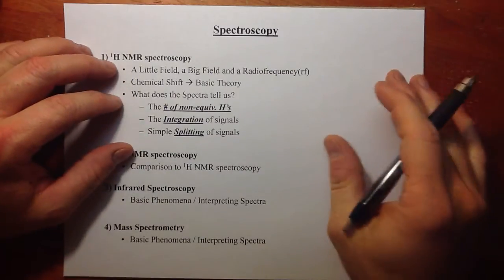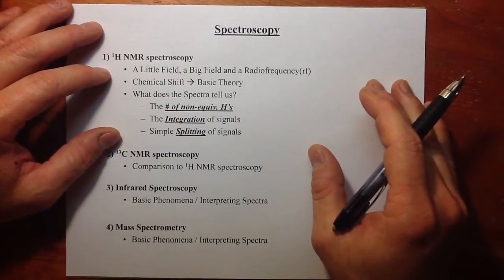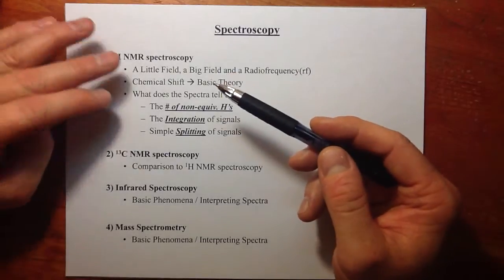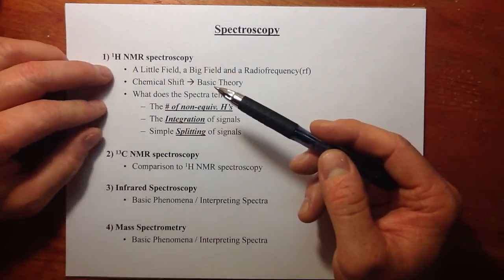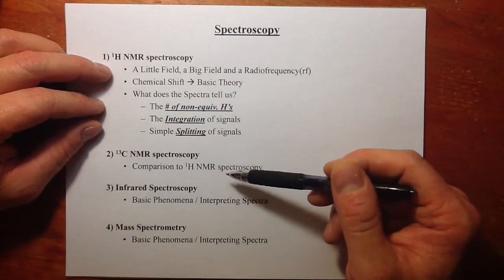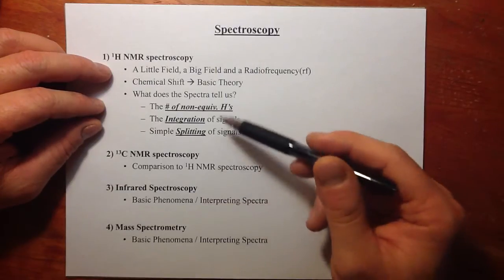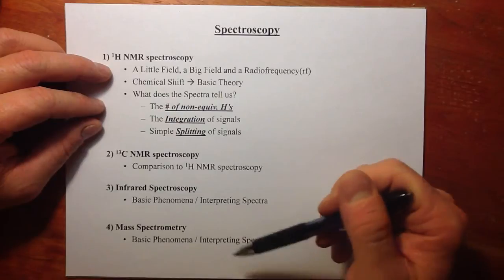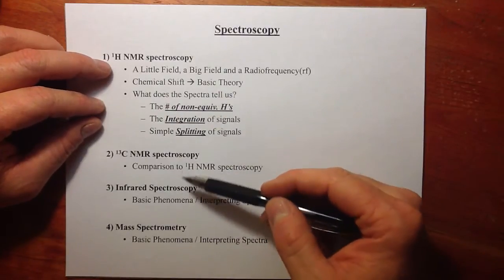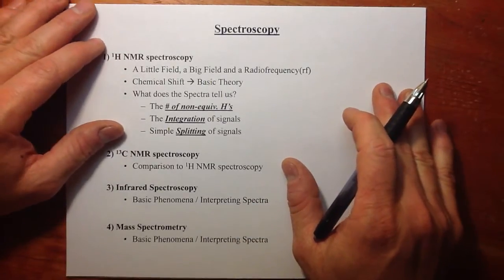This is the first of 6 videos on characterization methods used for organic chemistry. Proton NMR spectroscopy will gain most of the attention: 4 videos set aside just for discussion of proton NMR spectroscopy. There'll be a single lecture video on C13 spectroscopy and infrared spectroscopy, all of these involving light. Then the last video will be on mass spectrometry. So we have 4, 1, and 1, as far as videos go, covering characterization methods used in organic chemistry.